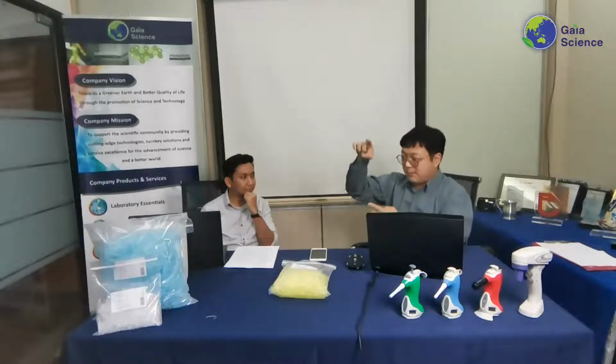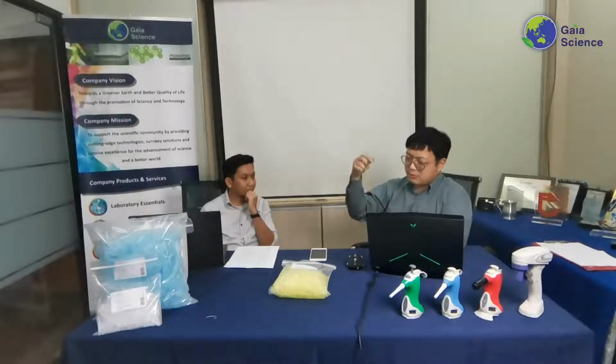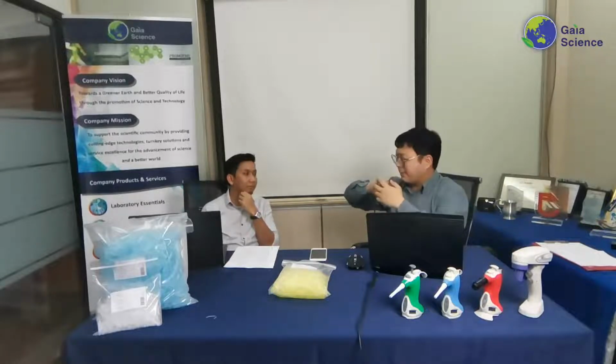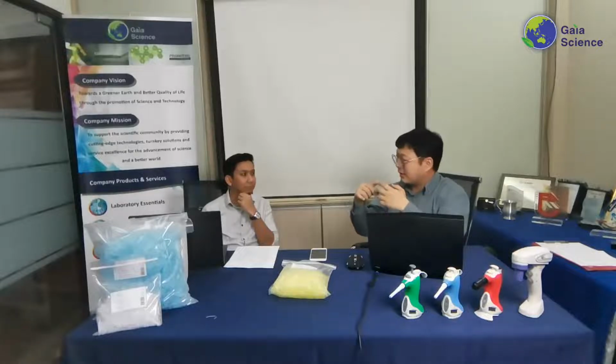So if you imagine the pipette like this, the pipette tip like this, there's a filter above here, and then after that, you might aspirate or take up your sample up to here. So sometimes when you're using a pipette, you might be holding it upside down or sideways, so that the sample might go back into the pipette. So that filter stops that from entering.